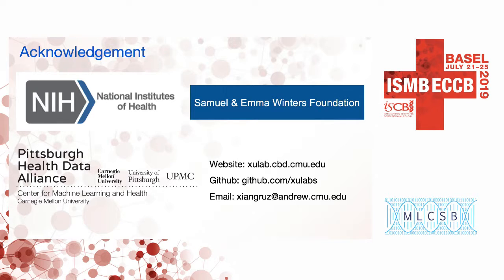But I think we could include some rotation invariance or rotation attention technique into the subtomogram classification methods.